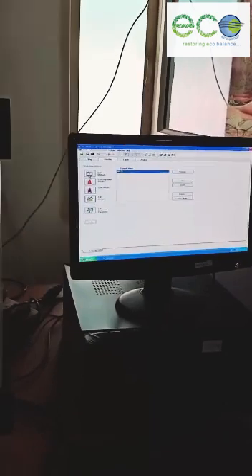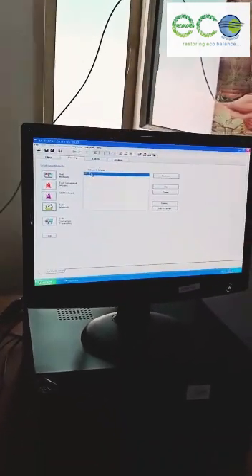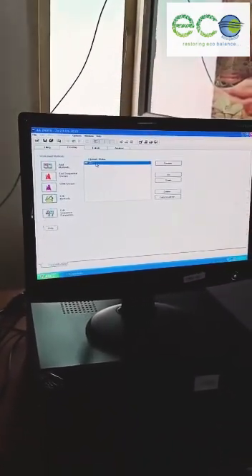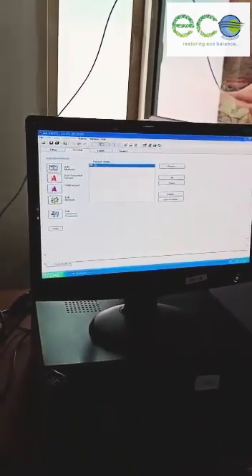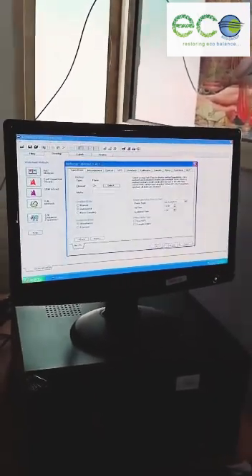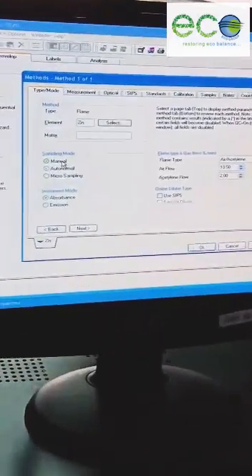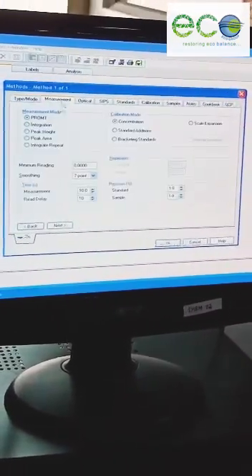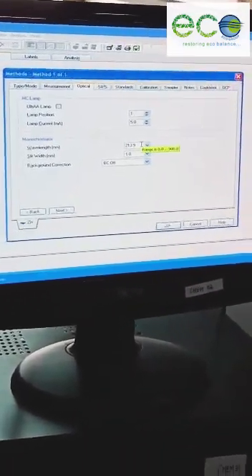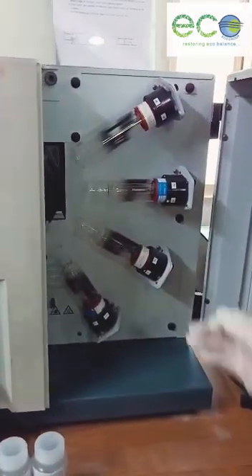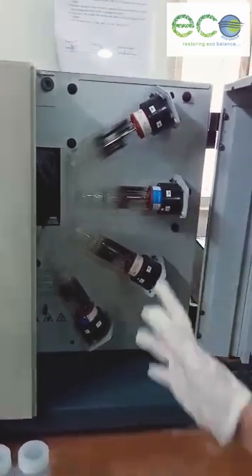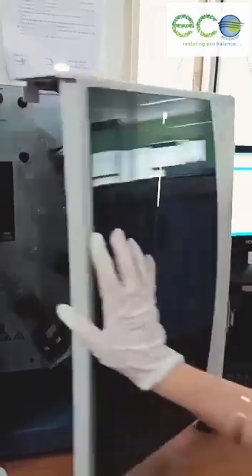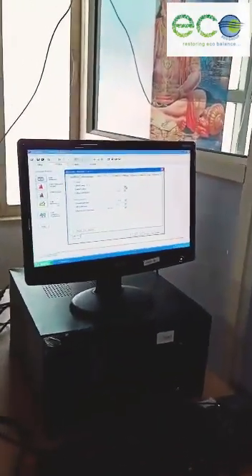We will open this software and select the metal that we want to analyze. Here we want to analyze Zinc. We will do all the settings from Edit Methods. We will set it to manual. Here are the lamps — these are the multi-element lamps. Zinc is positioned on number 3, so we will mention number 3 here.